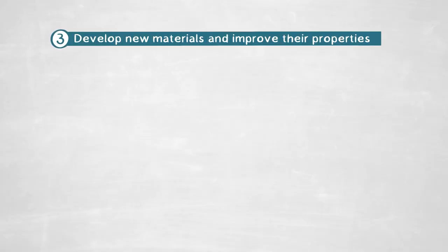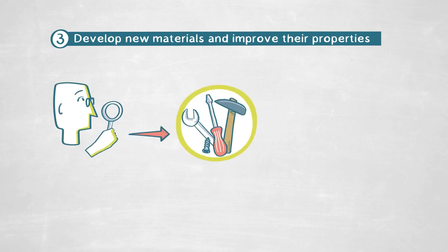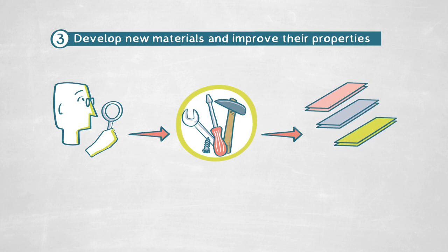A very intriguing thing about electron microscopy also is that we can basically probe our interfaces under realistic conditions, meaning we can heat up the sample as if it would occur in a real-life application. So we can study the dynamic behavior and evolution of these grain boundary phases. We can expose them to strain, or we can even put them under gas to see how they dynamically transform. And if we have all these keys at hand, then we can really build models to develop new materials, to improve the properties of materials, so that they're, for example, less prone to failure, less prone to degradation, and that they can sustain a better life. It would provide us the ultimate keys to thermodynamically, but also kinetically engineer materials.